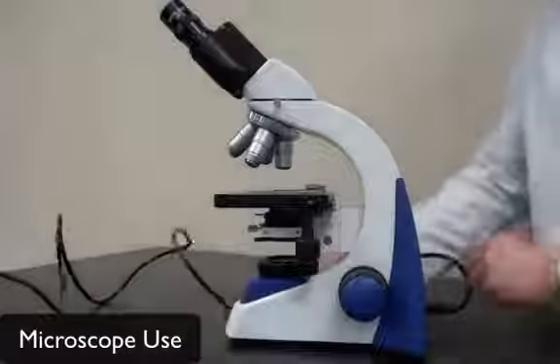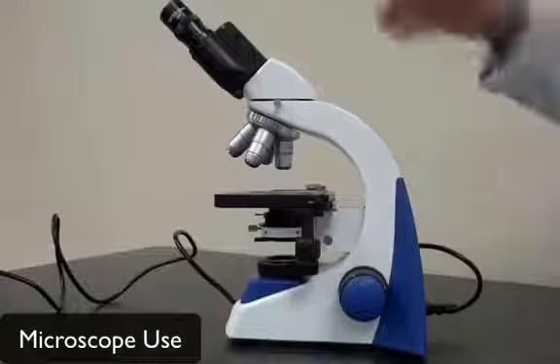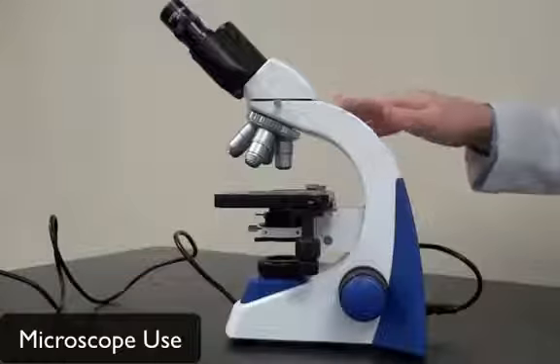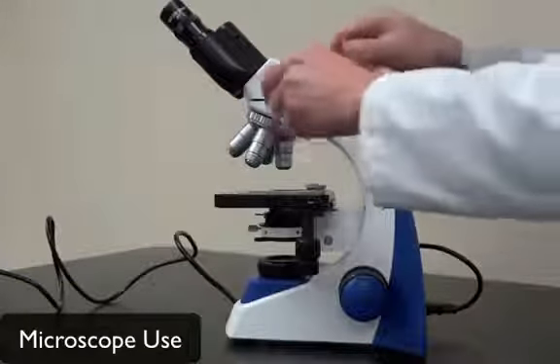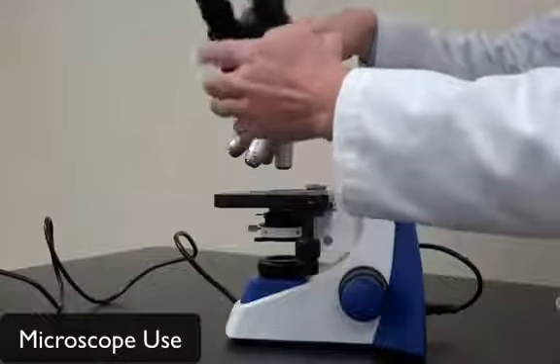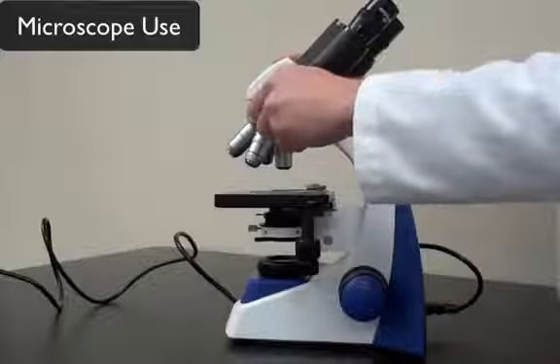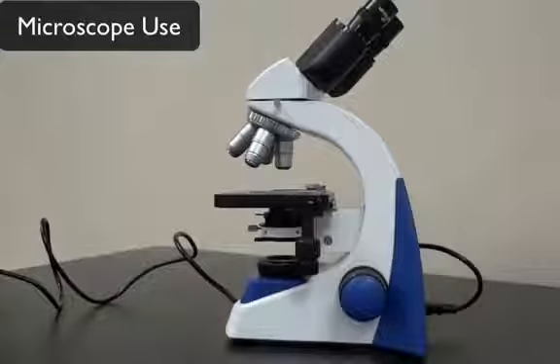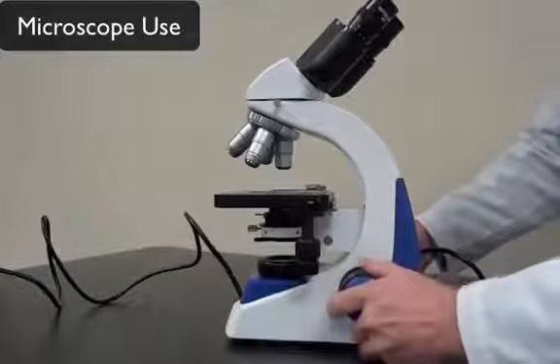We'll set that off on the side. And then first thing to note is the ocular lens. Now, the ocular lens is in this state, and I'm not going to go on the other side of the table. Again, we can change that by loosening up that dial and adjusting it to here. So I'm actually going to adjust it for my view right here. Now, you also note the stage here, and the stage should be at its lowest setting.